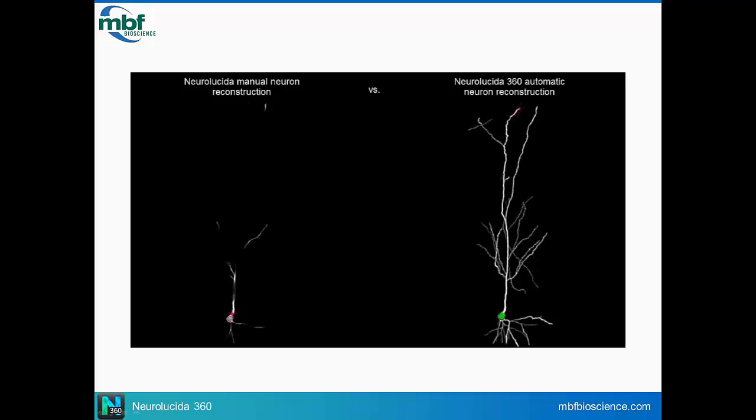Eric asks about how the program can be beneficial for whole brain quantification (Clarity), for tracing white matter tracts through the whole mouse brain. Eric, it's a very important direction that neuroscience is moving towards, the sort of, I'm going to call it holistic, but the gestalt of the brain. Now that we're able to generate these extraordinarily large image data sets, we need the tools to extract quantitative metrics from them. And so Neurolucida 360 will be capable of operating on these extremely large image data sets.